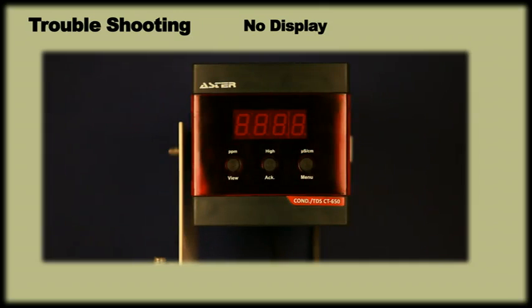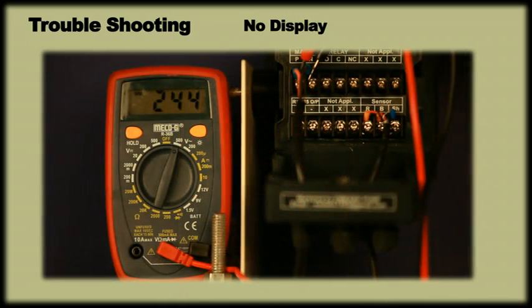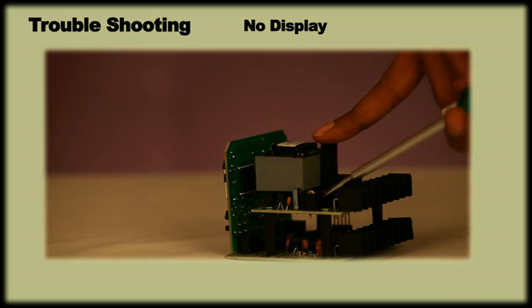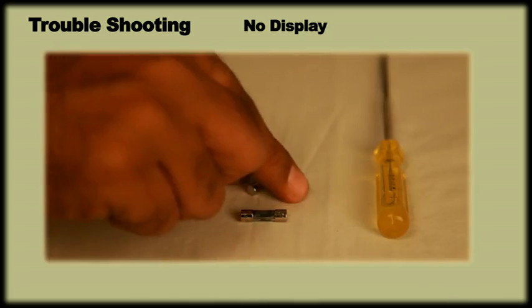Troubleshooting. If the meter shows no display, check the input supply with the help of multimeter and ensure it gets required supply. In case display remains off despite proper supply, open the instrument and change the fuse with a new 630 mA fuse.